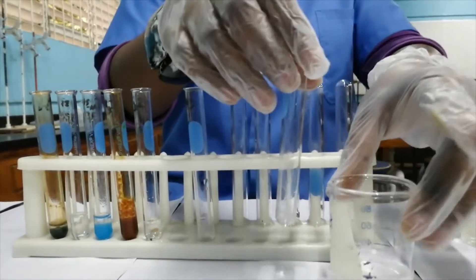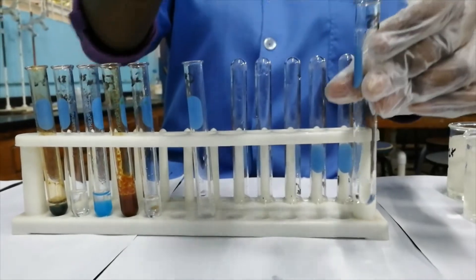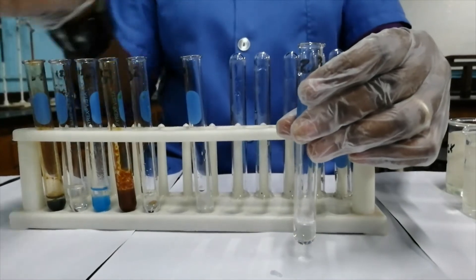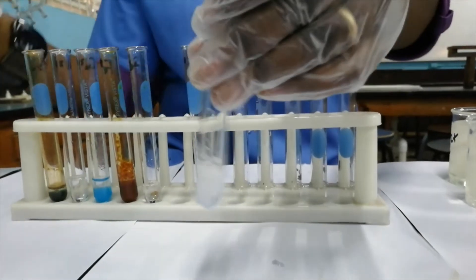The next cation that we'll be testing for is the zinc cation. It's a colorless solution, just like lead and aluminum. If I add sodium hydroxide to it, then I get the formation of a white precipitate.